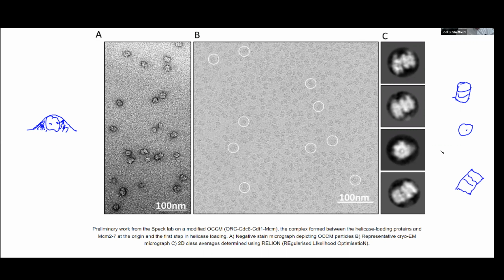And as you see from these images right over here, it's possible to collect and reinforce all those images that, if I hunt around in here, look more or less like this, and all those images that look more or less like that, and stack them together so that you extract the essence of each one of those perspectives.